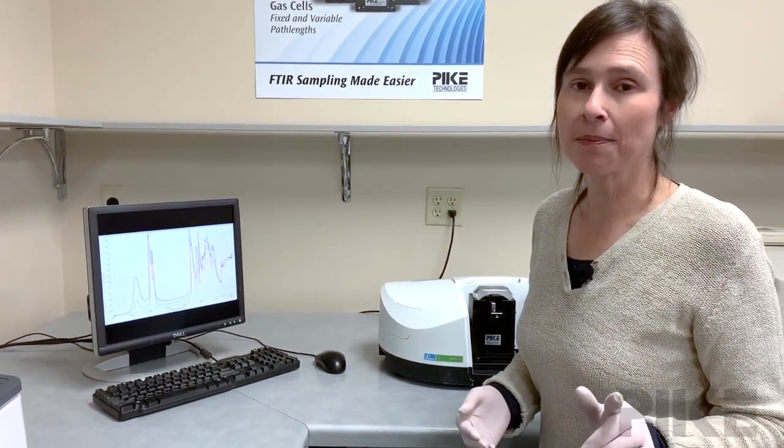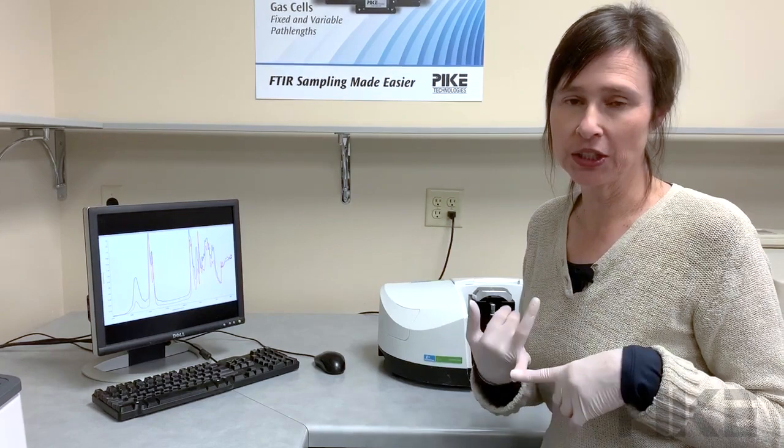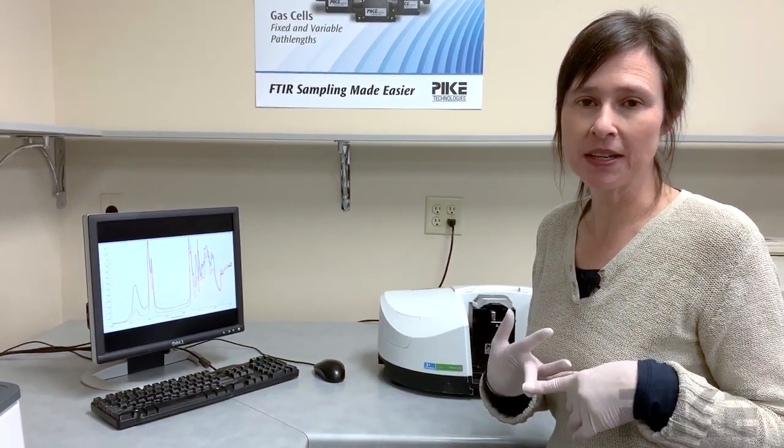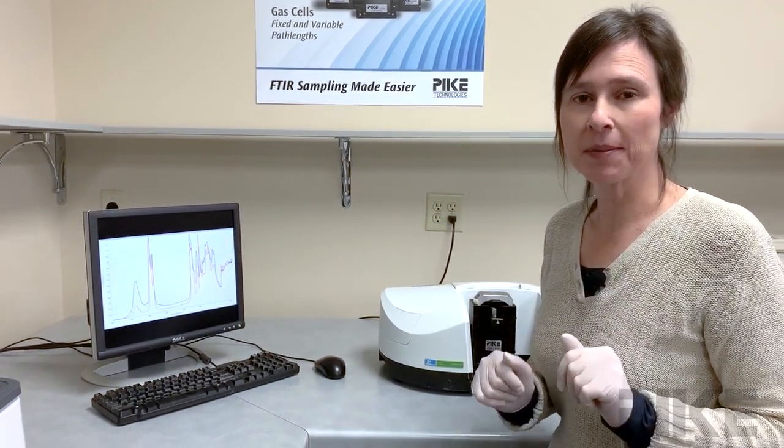There are several factors that can affect your results. Those would include particle size, how you pack your sample into the cup. Your sample needs to be homogeneous. So all these things come into play.